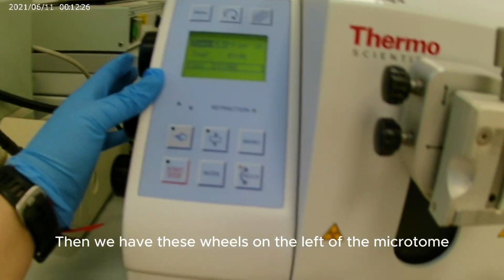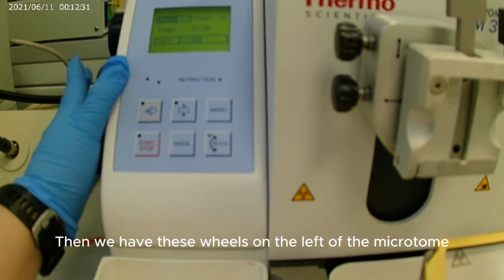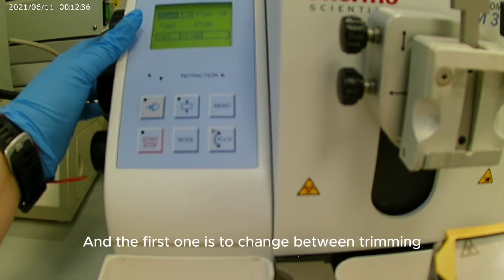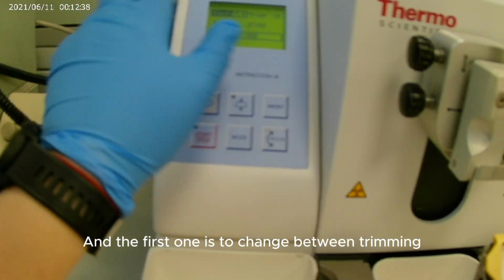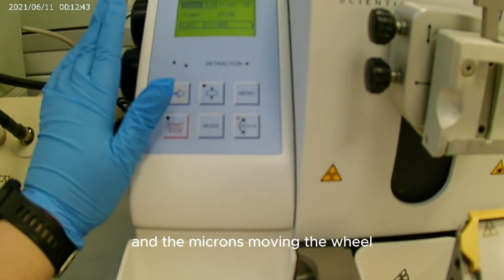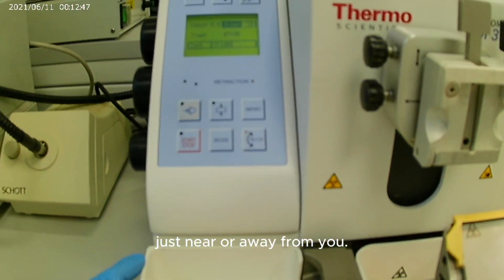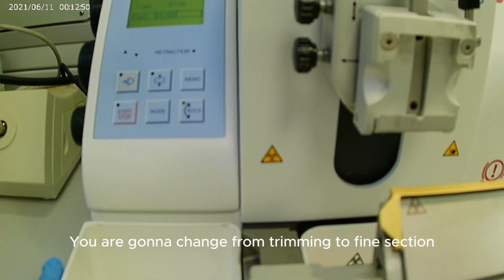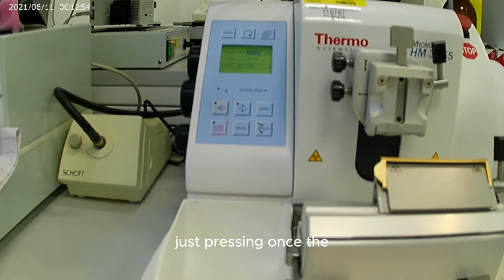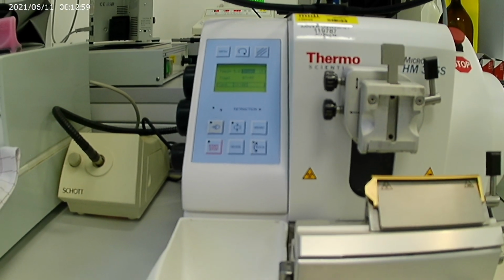Then we have these wheels on the left of the microtome, and the first one is to change between trimming and fine section, and the microns, moving the wheel near or away from you. You are gonna change from trimming to fine section just by pressing the first wheel once.